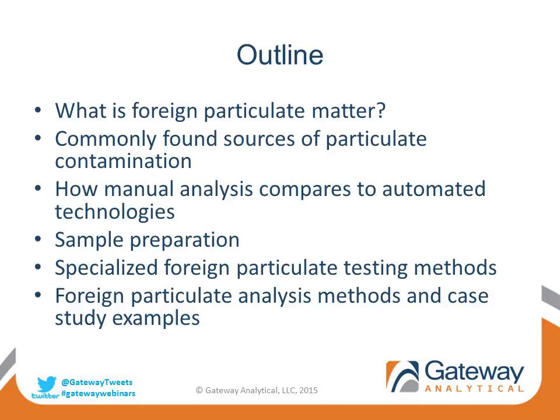Now I'm going to go over a brief outline of today's webinar. First, we'll begin with a brief definition of foreign particulate matter, along with some common sources, a comparison of manual and automated analysis, an overview of sample preparation and analysis methods, including specialized analysis methods, and then finally our case studies.